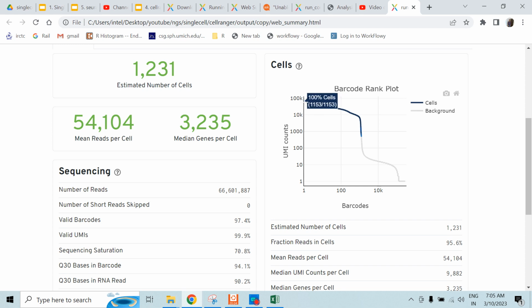So now let's take this first point. What does it mean? It corresponds to the UMI total. How many UMIs are there? Like 100k UMIs, such a high number of UMIs. So now we check in how many cells that much UMI is detected. In this case, there is, let's say, only one cell where this much amount of barcodes are there.